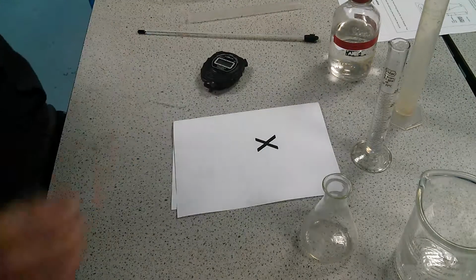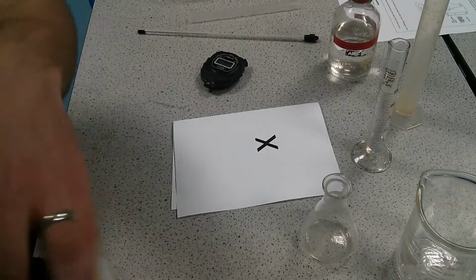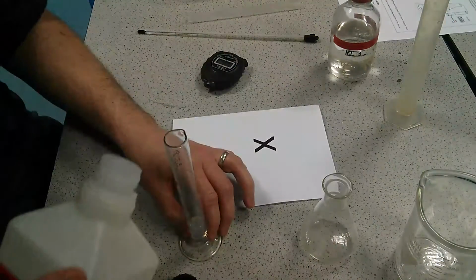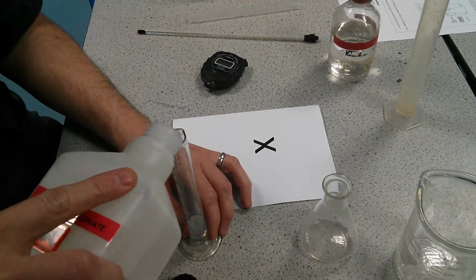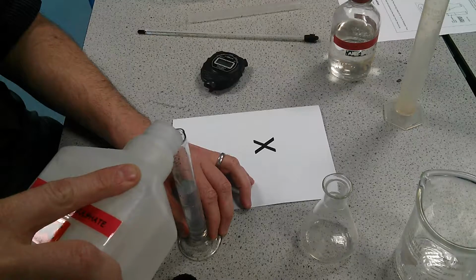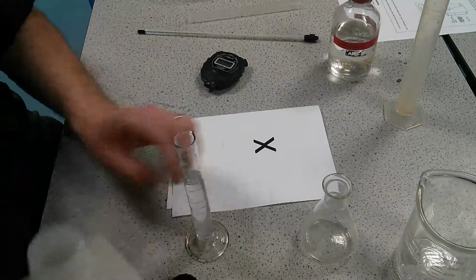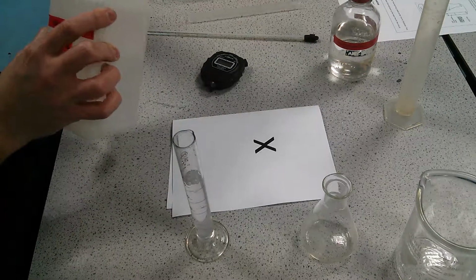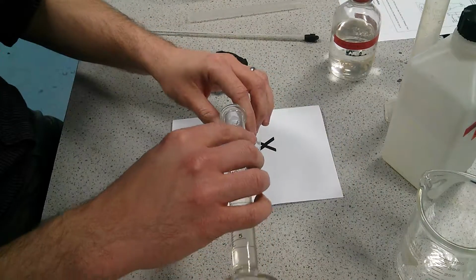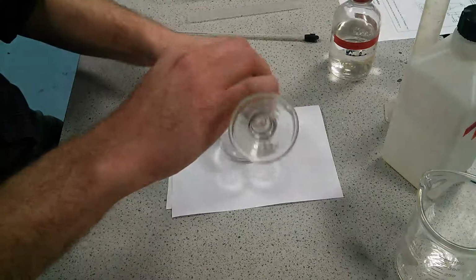so hot water. So the first thing you need to do is measure out 25 millilitres of sodium thiosulfate, which you can pour into your measuring cylinder. It should be on the desk. And then we always put our lids back on for safety. Pour that into our conical flask.